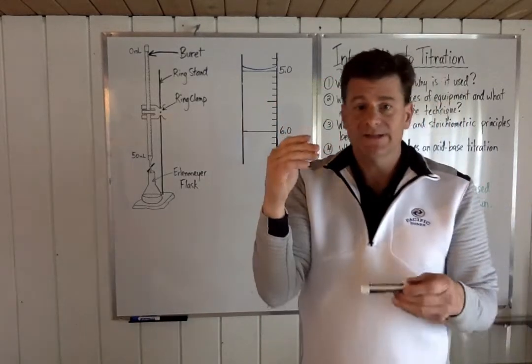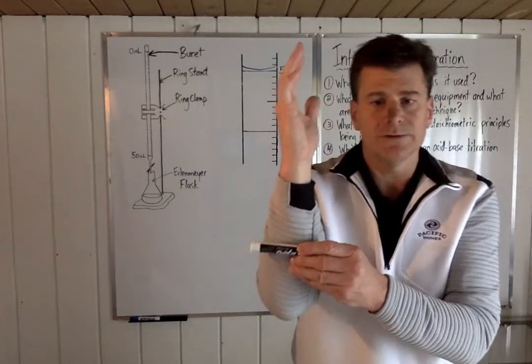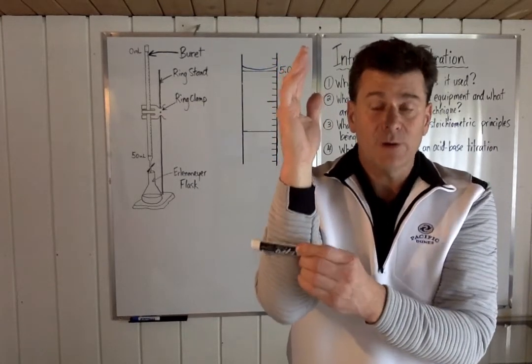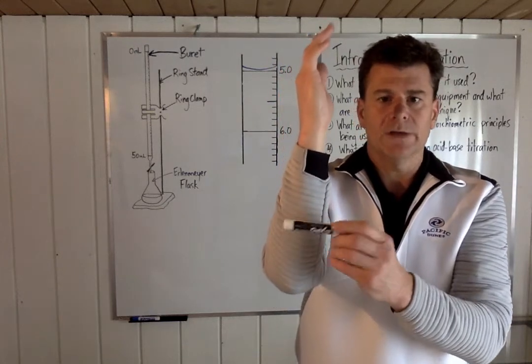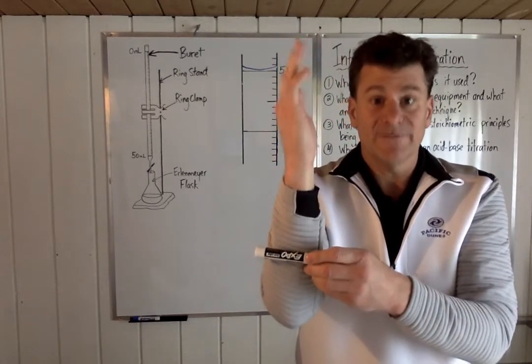It's called filling the tip. When you're doing a titration, you always got to fill the tip. So you'll add the solution in, the thing will be closed, and into a waste beaker, you just kind of squirt some out to fill the tip, and then you close it. And then what happens, kind of like a little vacuum effect, the little bit below, okay, so if here's the valve, then down here where my elbow is, that bit right there then gets filled with solution.